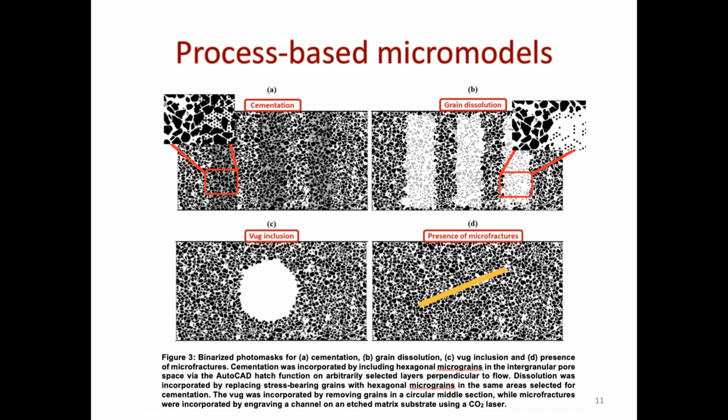So if you're looking at trapping or something of that sort, you can actually see what a layered type of medium, which most of the time we have in practice, does to whatever process you want to look at. You might be looking into foams and you want to look at what's happening to the foam quality.